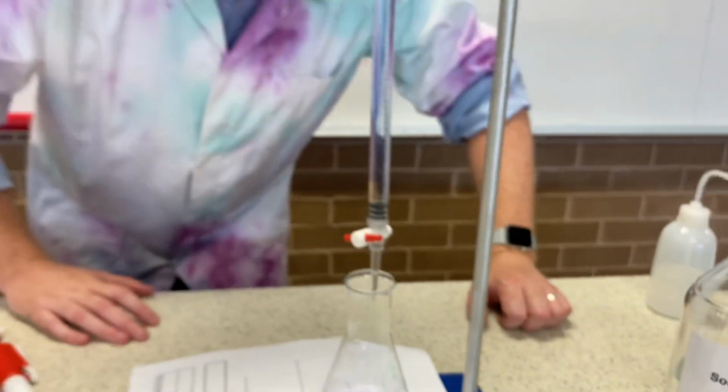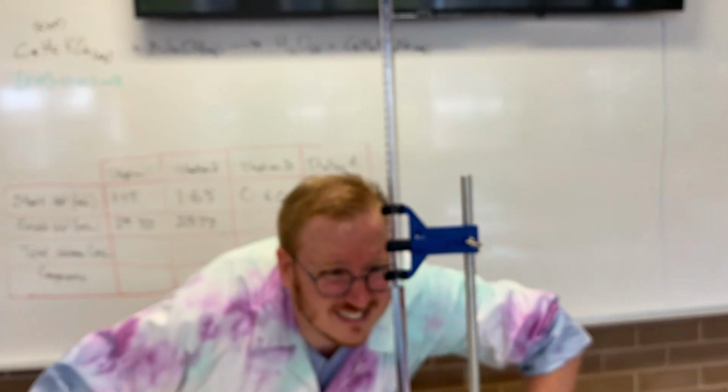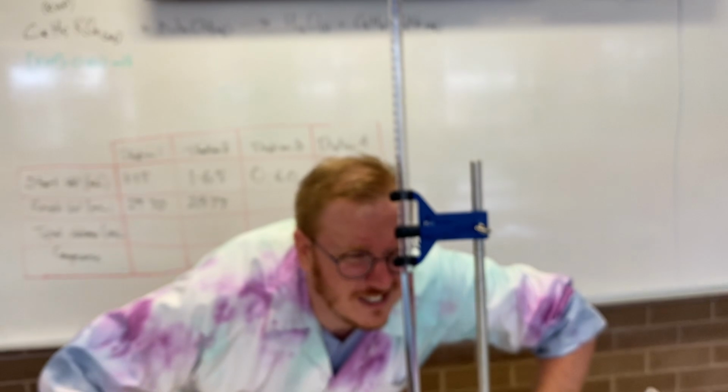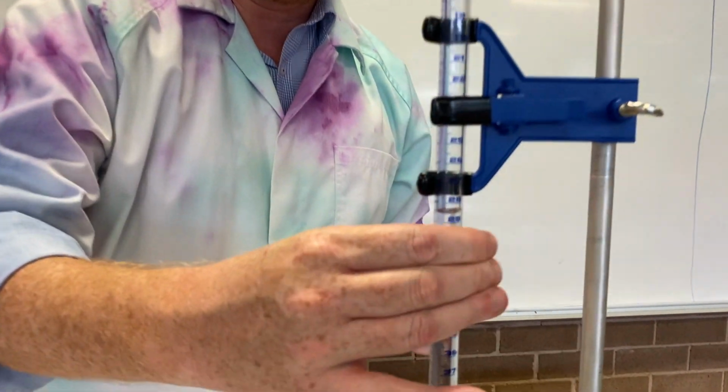Okay, I'll read off my volume. It's between 28 and 29. It's over halfway. It's 28.60 by my reading.